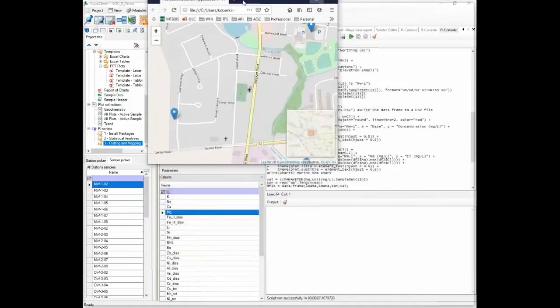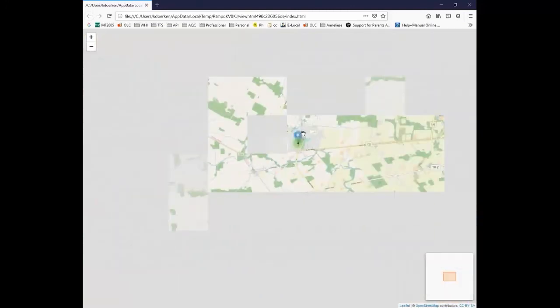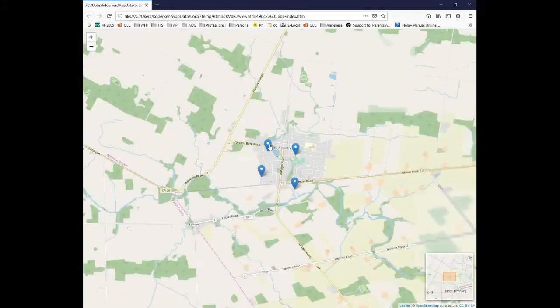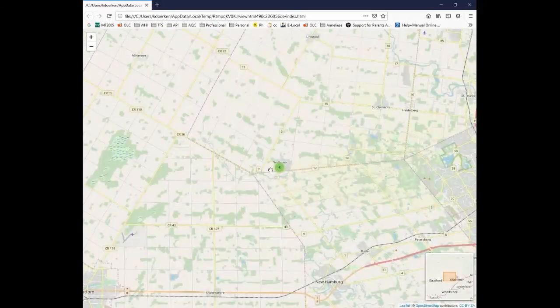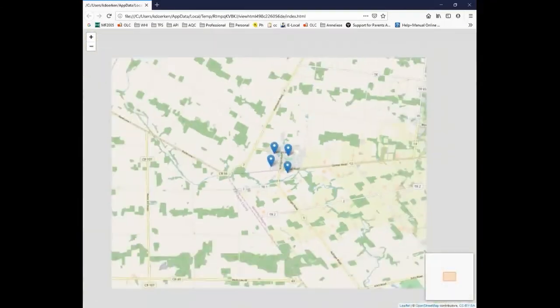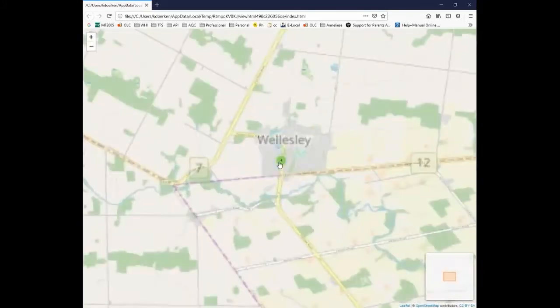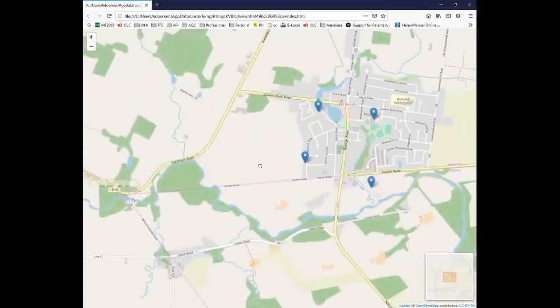So the first thing it did was it created a map in my default browser. And this is a map of our station groups. You can click on any of these icons, and I've set up the script so that it can provide some basic information about each of your locations. I've also added a little feature so that they converge into points. So if you have a lot of sampling locations, you'll be able to collapse those into information bubbles that way, which is quite useful.